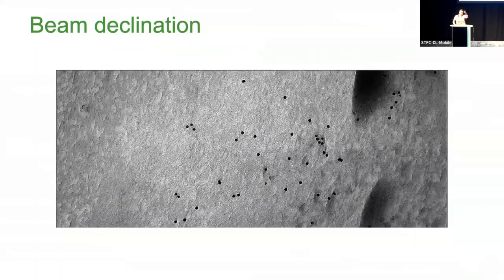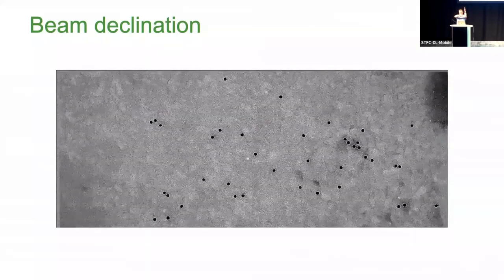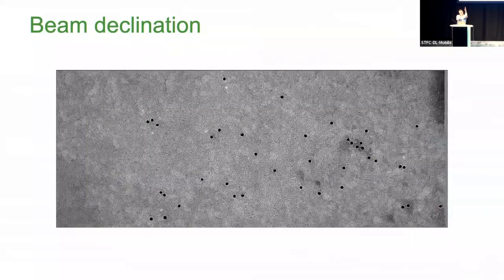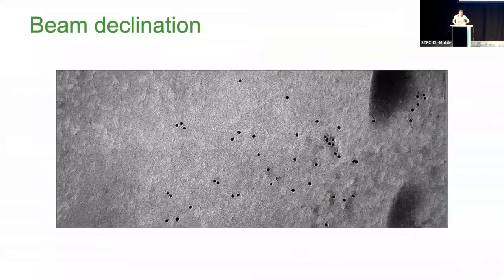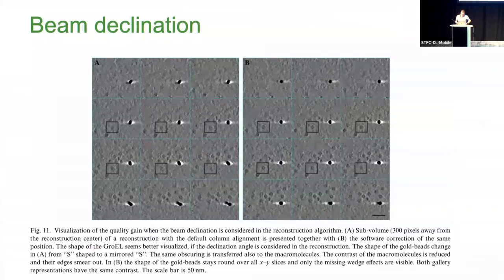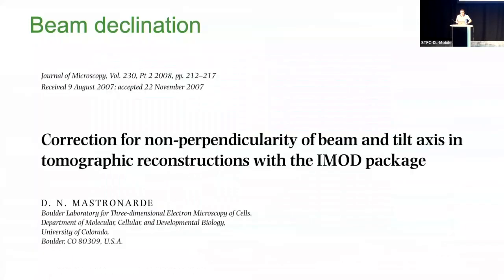Beam declination has been discussed for a while. Archelis from Carazo's group realized that on a standard ThermoScientific stage, if you take a tomogram and follow the beads, you expect a line along the tilt axis but instead get an oval — meaning the optical axis and the stage tilt axis have a slight offset, giving you a conical tomogram. That causes problems in reconstructions. David Mastronarde fixed it in IMOD so you can solve for it. Nicely, for people with fringe-free illumination on the Krios, changing the stage height happens to minimize beam declination.